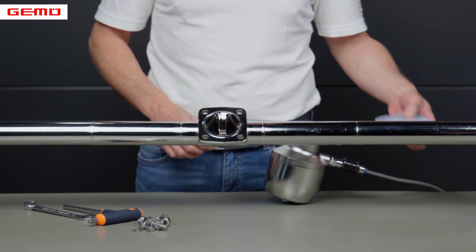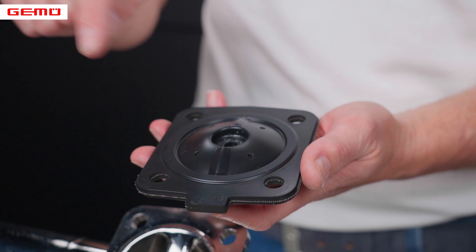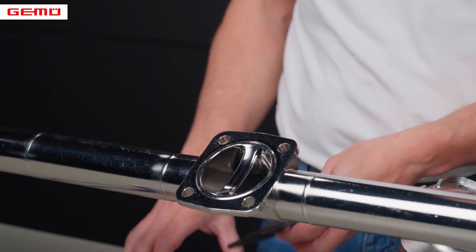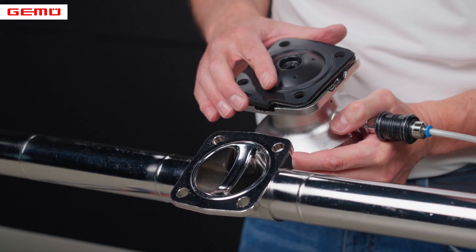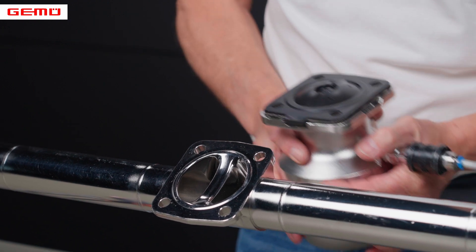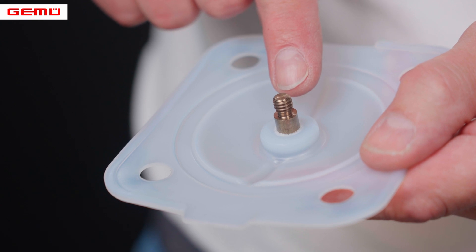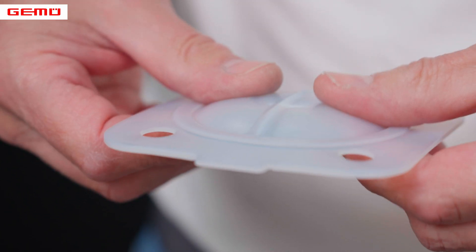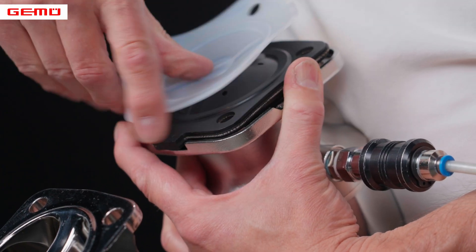Before installing the diaphragm, we recommend that you check the material code. A new diaphragm should always be used for each disassembly. The backing diaphragm is placed on the actuator flange in the correct position. The GIMU code 5M diaphragm has a mechanical stop on the thread. The PTFE face is inverted upwards by hand and screwed into the valve spindle clockwise as far as it will go.